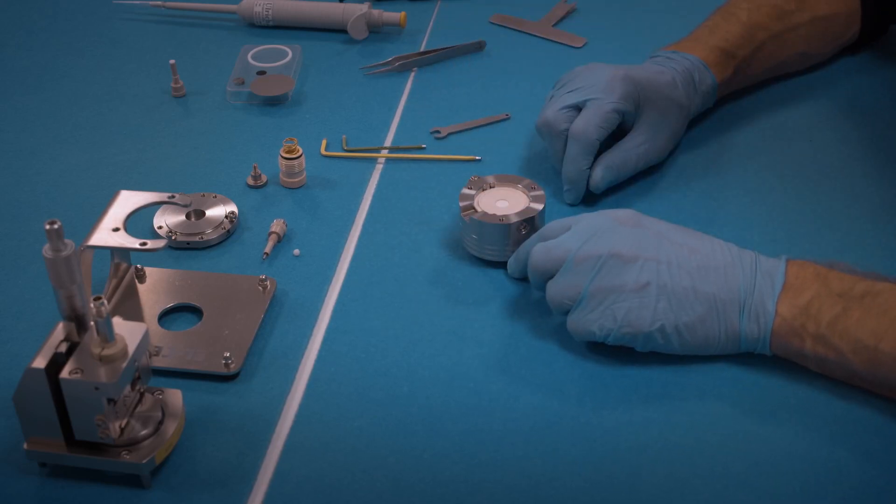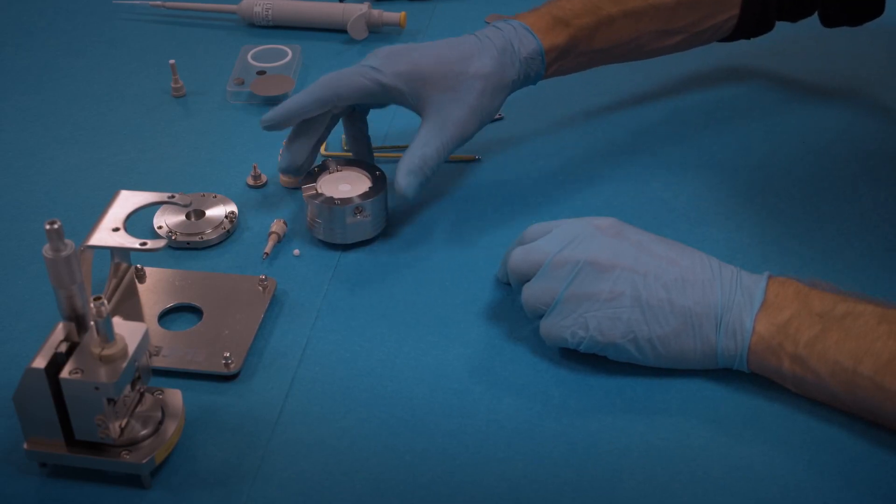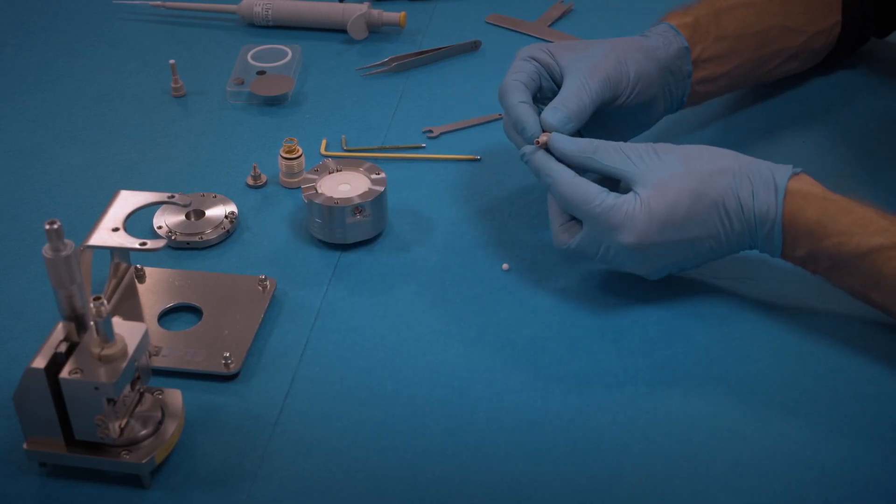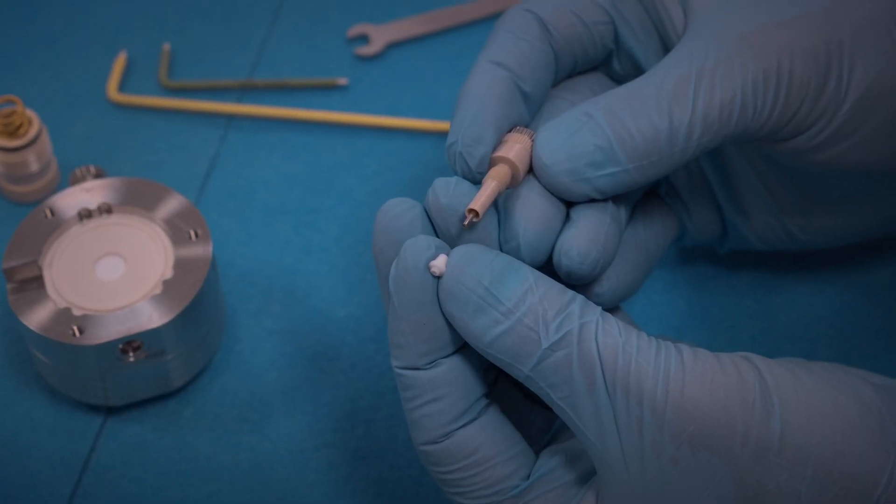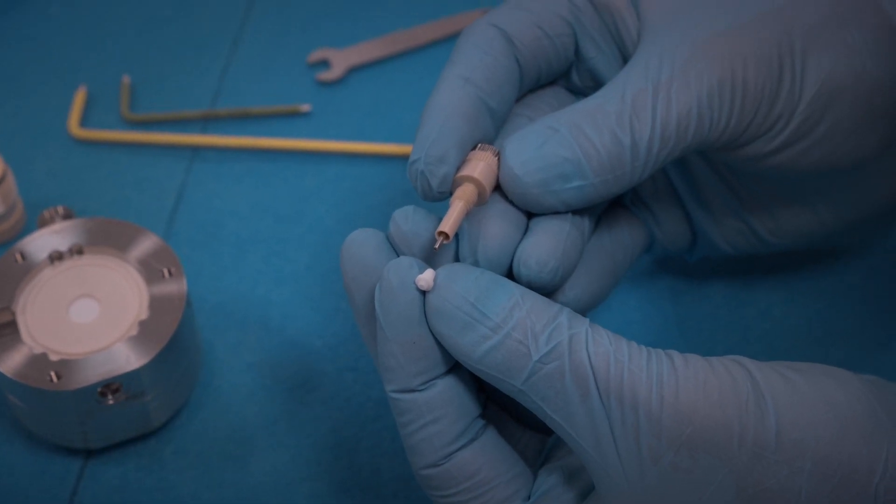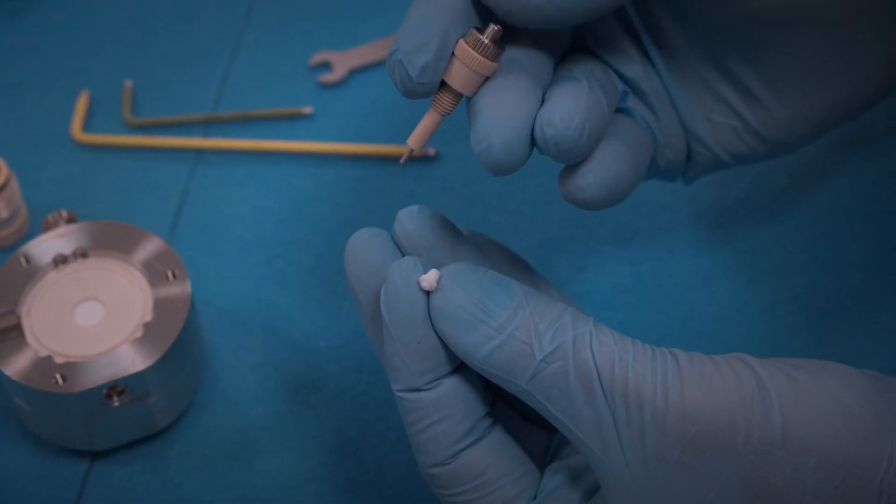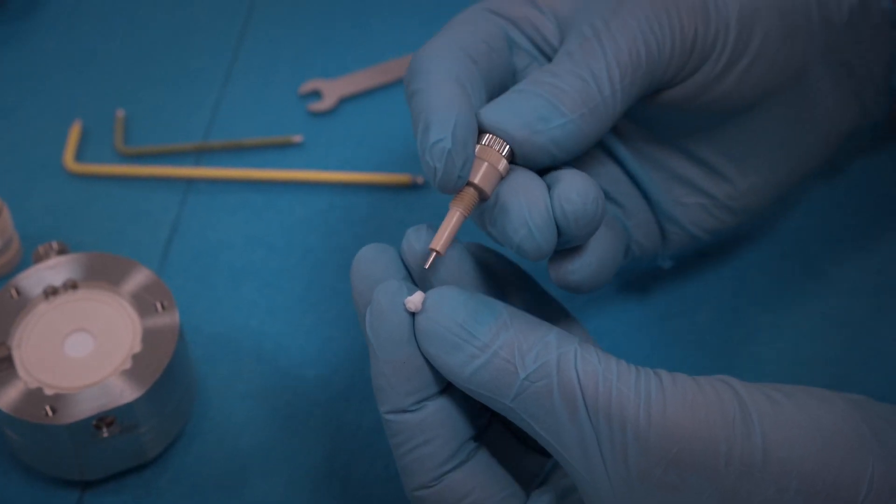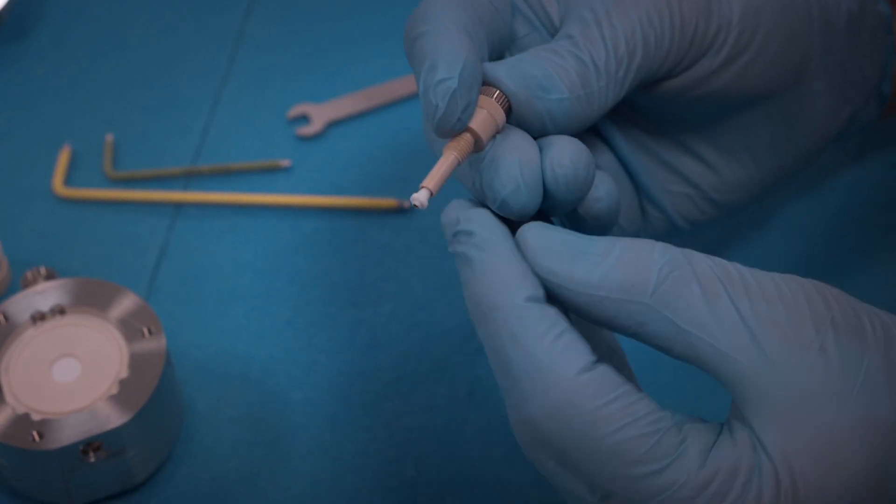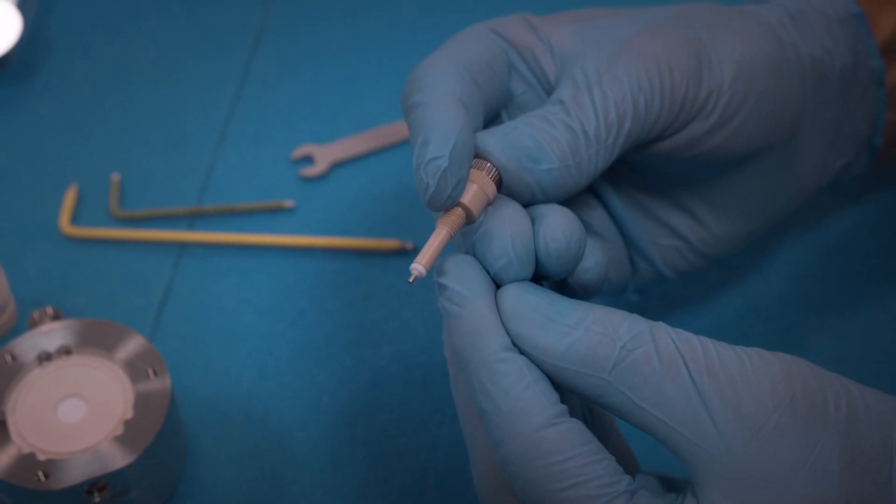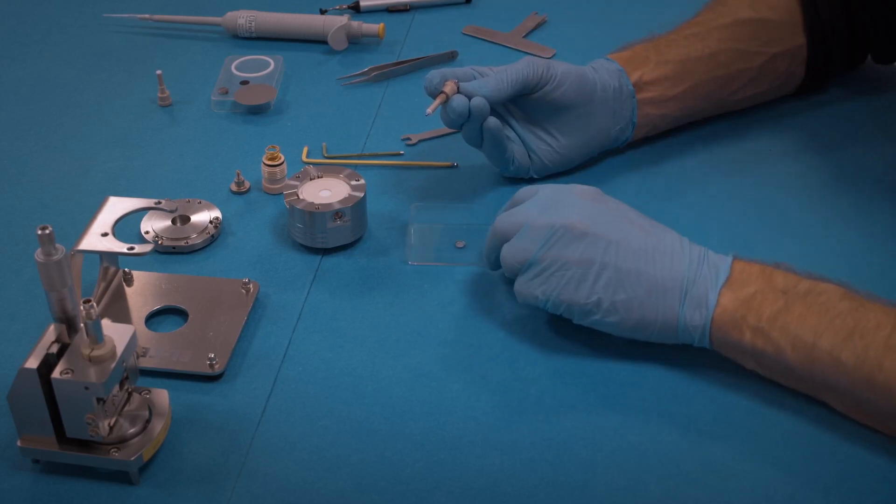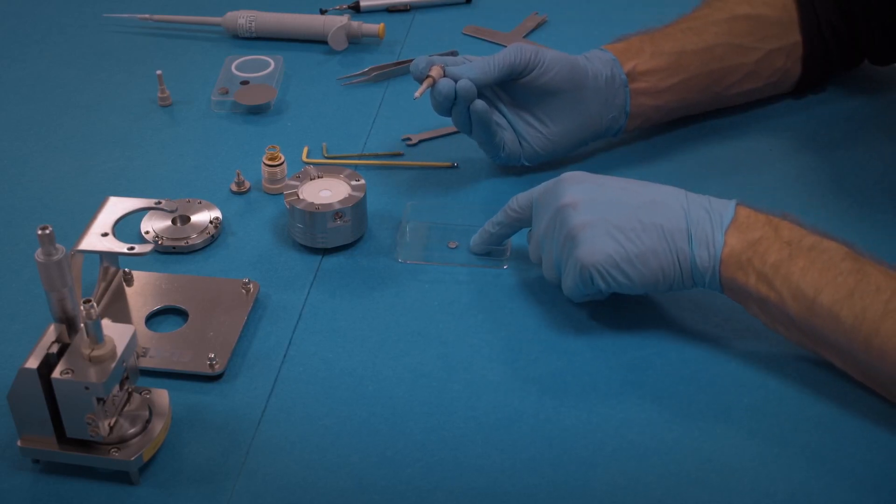We assemble the reference pin. We push this PTFE ferrule onto the pin, and while we do this we press onto this button on the other end of the reference pin. This is to make sure that the ferrule is really here in the uppermost position.